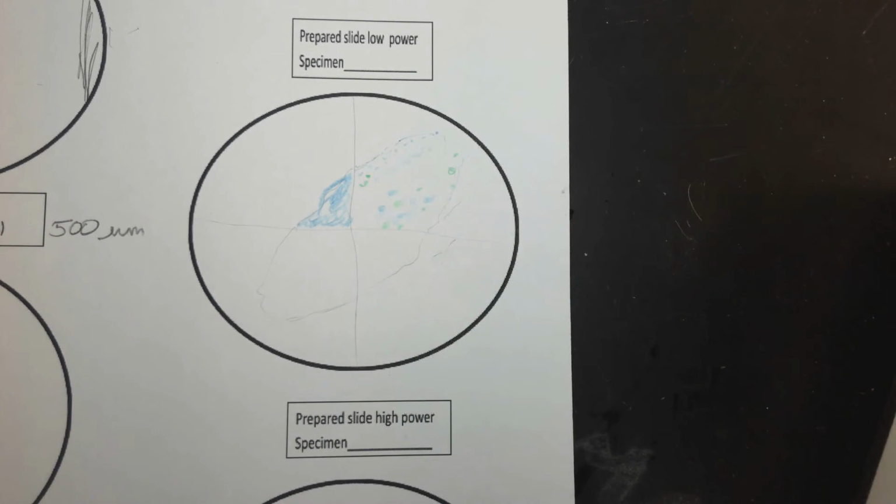And you're just drawing in one quadrant, then you move on to the next quadrant, trying to portray the colors as realistically as possible. From the virtual lab, you also realize, or you've learned, that the color of the stain helps to identify the organism based on what stains it takes up. So accurate color is extremely important when you're drawing what you see under the microscope.